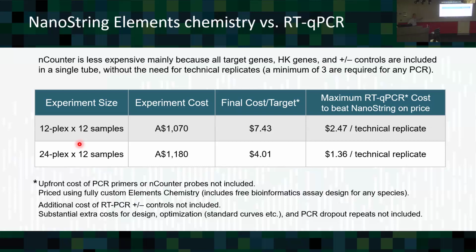And to get into your low expressors, you've got to do an awful lot of work, a lot of reads. So it gets pretty expensive. I mean, costs are coming down, but you end up with terabytes or whatever it is now to sort through, whereas this is just a really simple molecule count. So if you know your target, yeah.